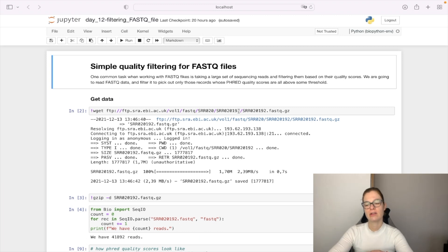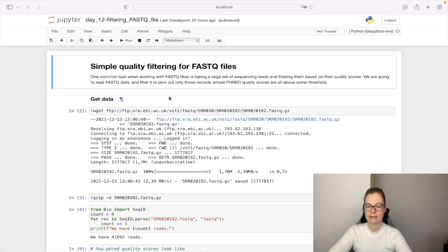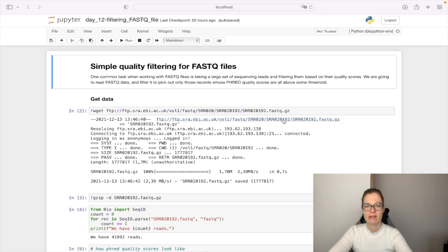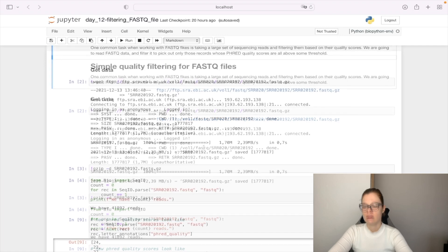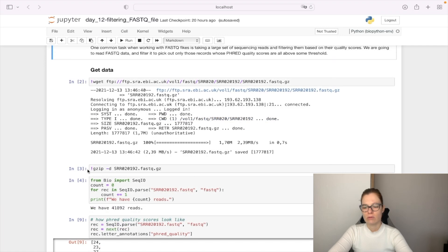First thing we do is get the data with the wget command from this link here, and this will give us the zipped FASTQ file. The next thing we need to do is unzip it.